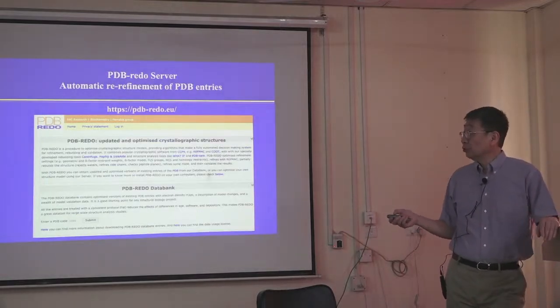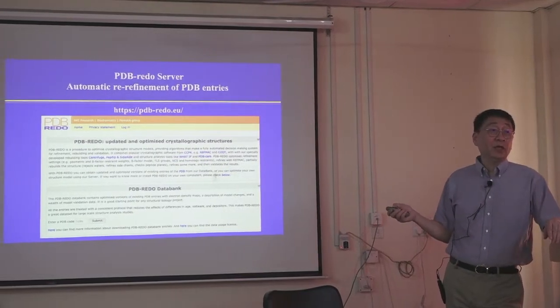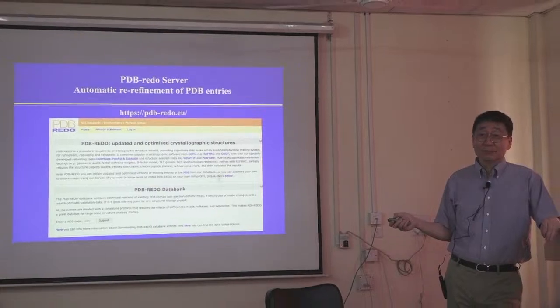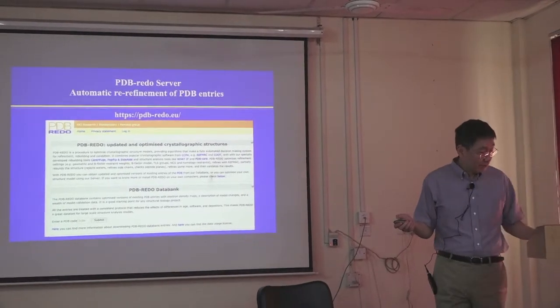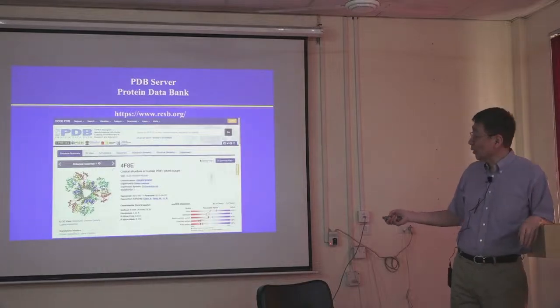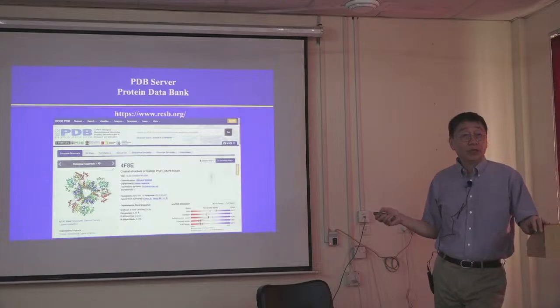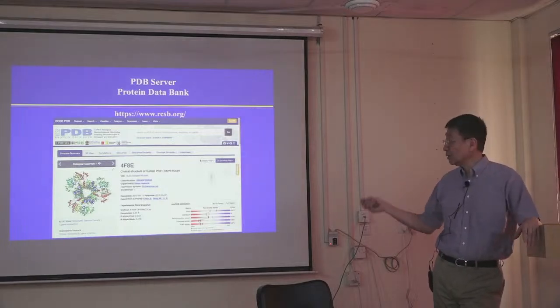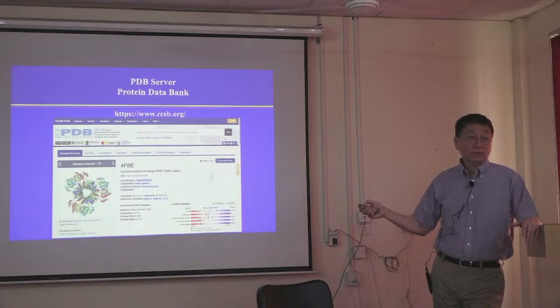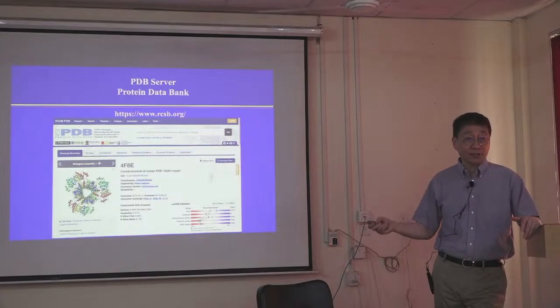And what you may not have heard of is a server called PDB Redo. As I mentioned, our structure from 2006 will be all the way over here. What PDB Redo did is it took the deposited structure factors and the model and automatically re-refined the structure using modern technology.